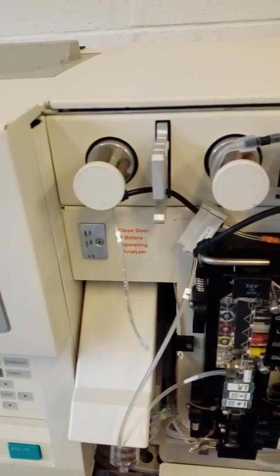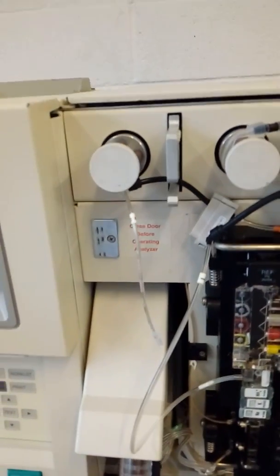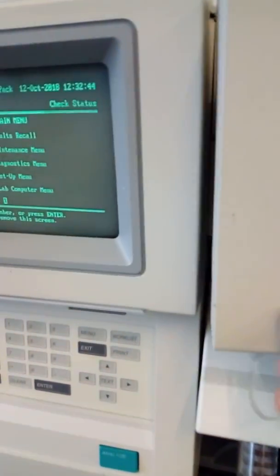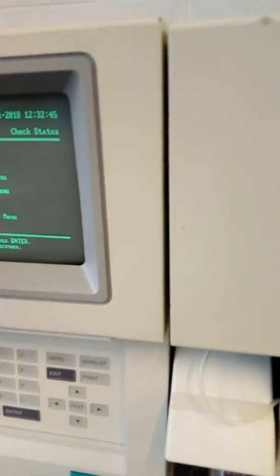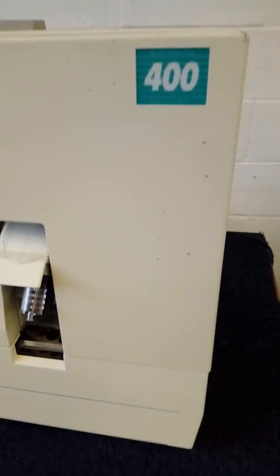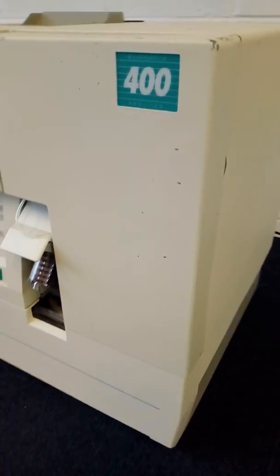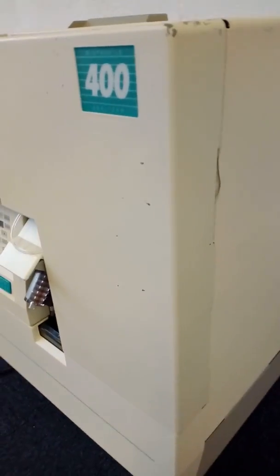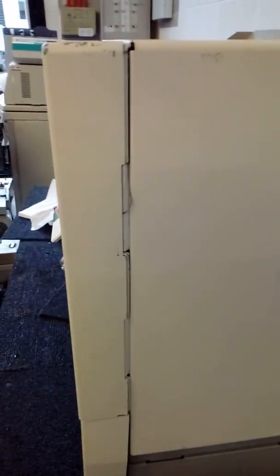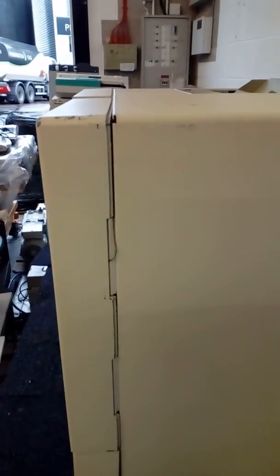Then go to condition, as you can see. There are just small signs of wear and tear with this piece.